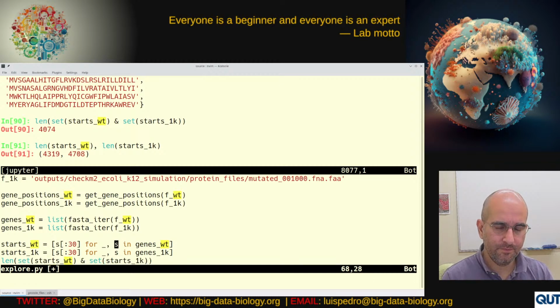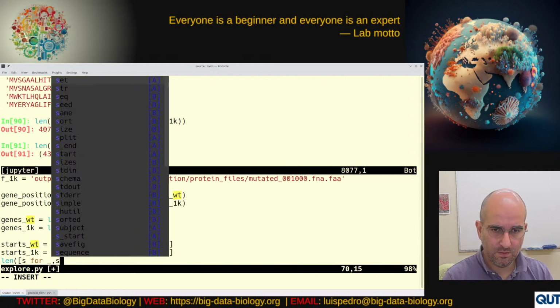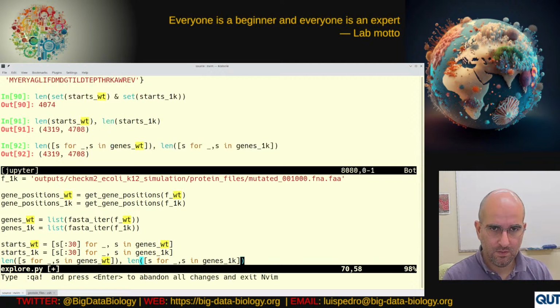Okay, let's actually check all of the sequences.